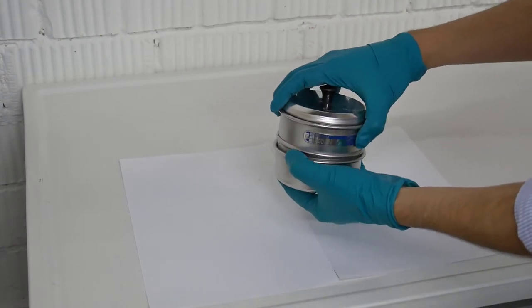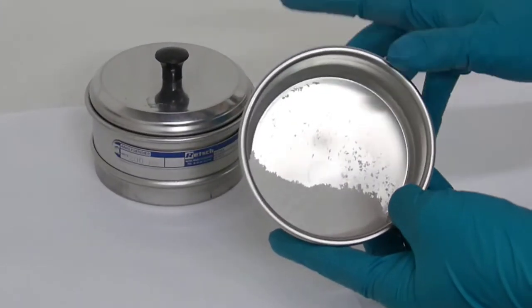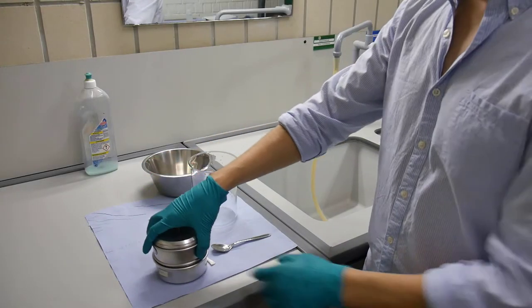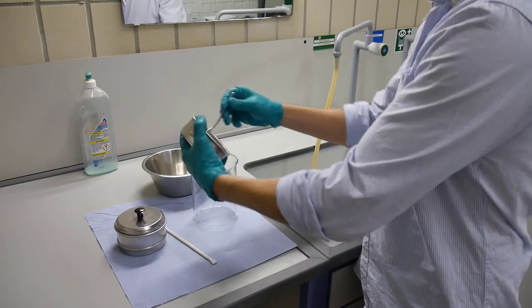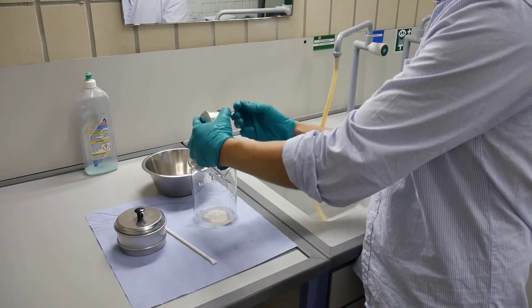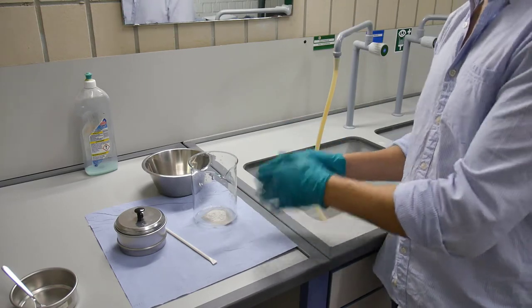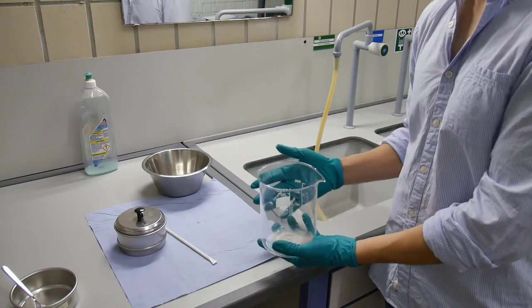These would be all the grains that are smaller than 200 microns. Now it's time to put the powder into the beaker — for that we can use the spoon. As you can see, we have very little material in our case. This sample is a rhyolite, a high silica sample, so most likely it would have a lot of zircons and we don't need too much sample for this type of rock.